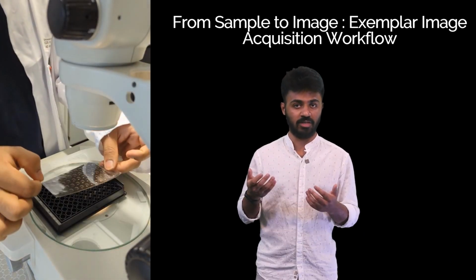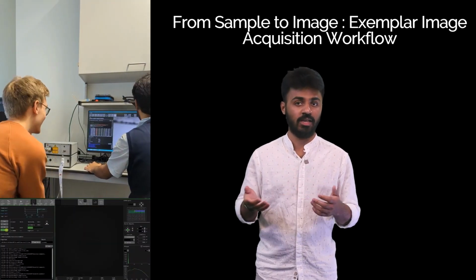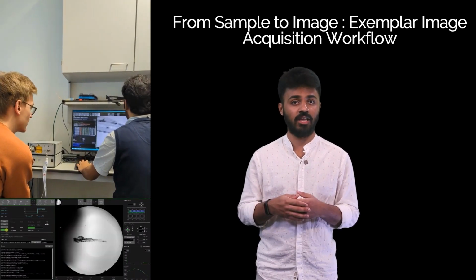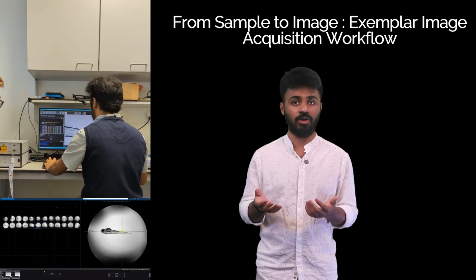Post-optimization, we initiated the imaging experiment and began acquiring images of the live embryos. Finally, we successfully acquired high-quality images of live zebrafish embryos post-injury using a high-throughput imaging setup.